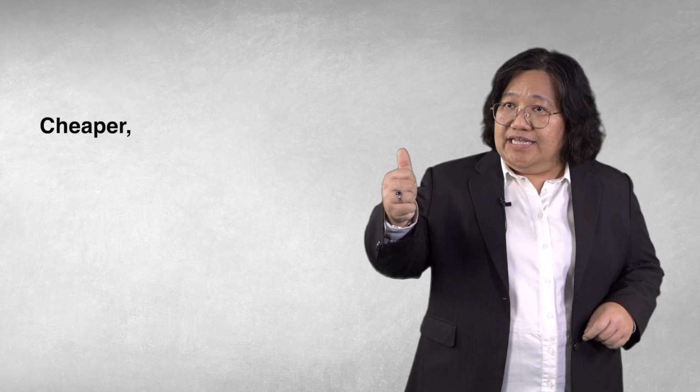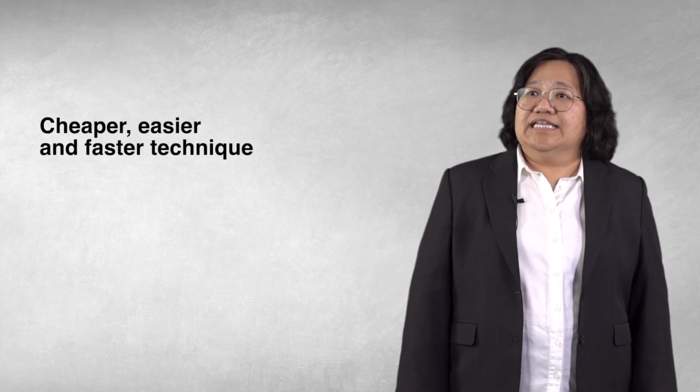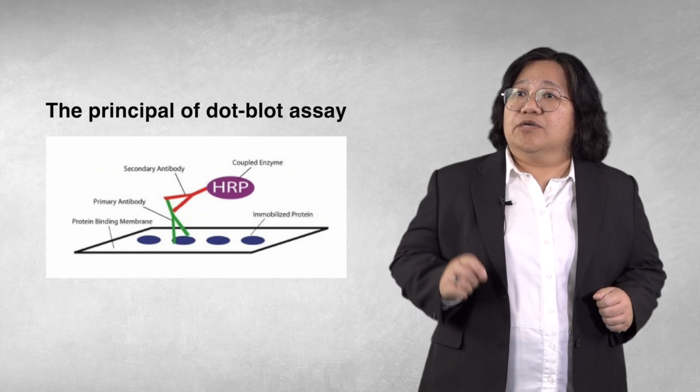In this study, we developed an assay based on the Dot-blot assay platform. Dot-blot assay is a cheaper, easier, and faster technique to detect the presence of protein in a biological sample. It works based on the immunodetection principle for identifying specific protein. Generally, in the assay, protein is immobilized on the membrane, followed by successive incubations with primary and secondary antibodies that carry a tag to allow visualization.